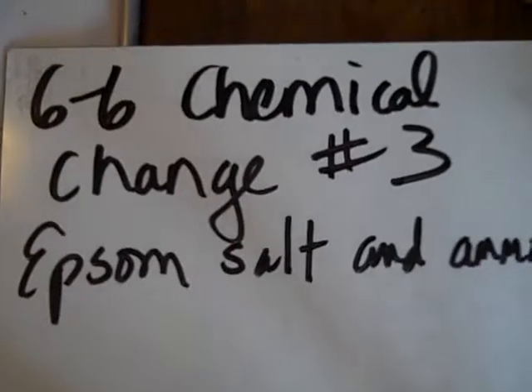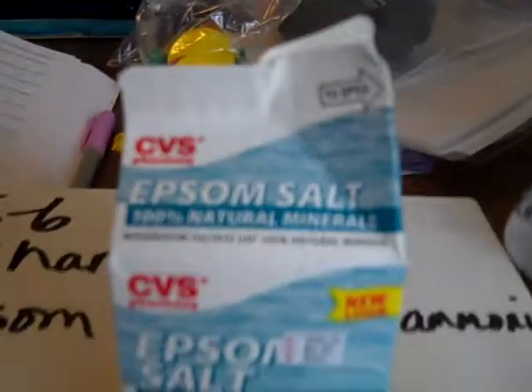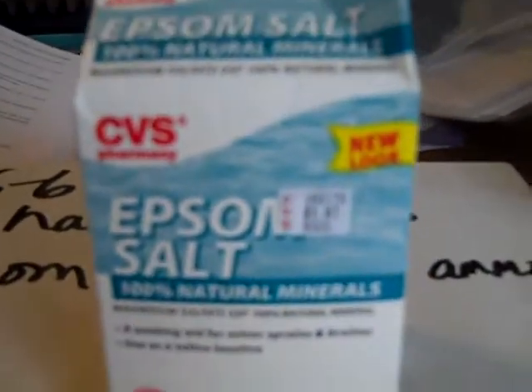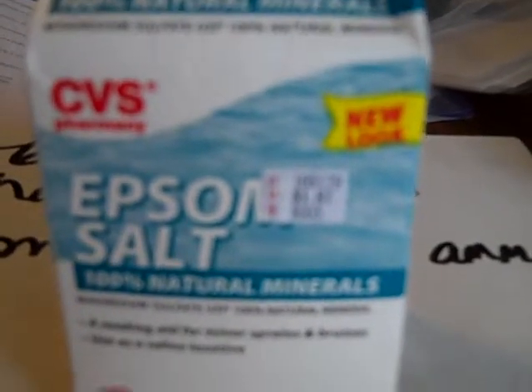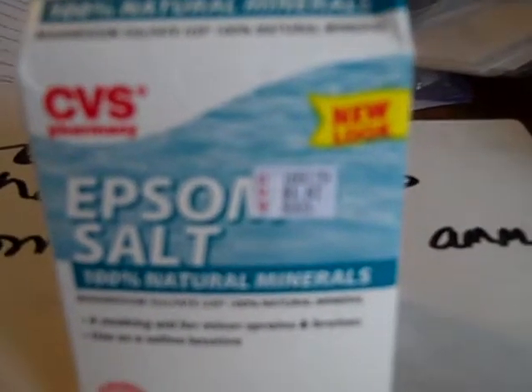Now we're going to do 6-6 chemical change number three: Epsom salt and ammonia. Here's Epsom salt — a lot of people use it to soak their feet when they sprain their ankle. It's a mineral solution. We've got 50 mils of water, a flask, a cup, a spoon, and ammonia.